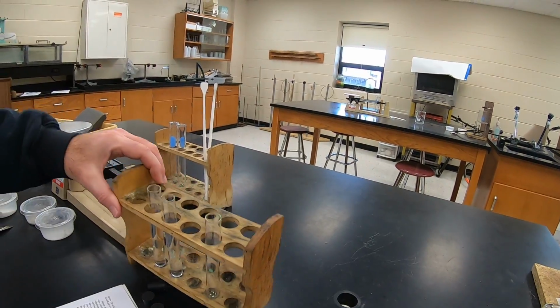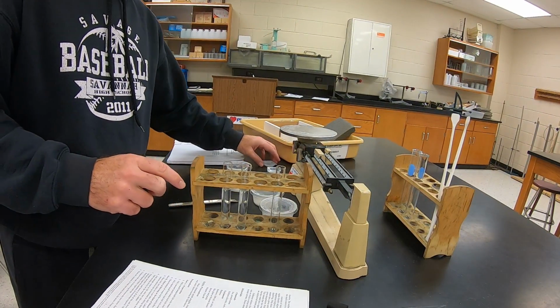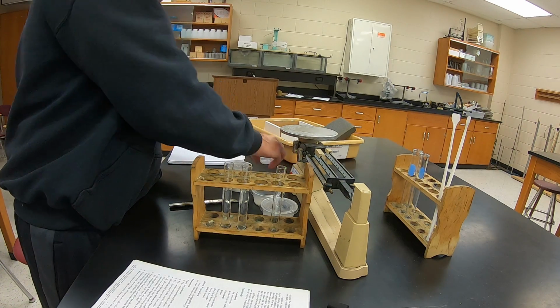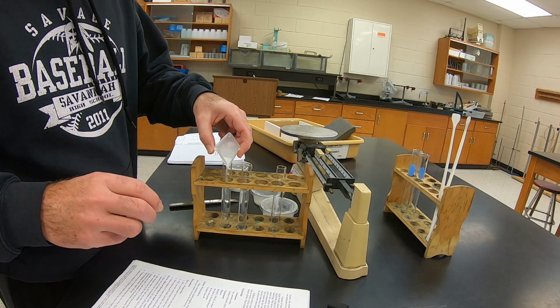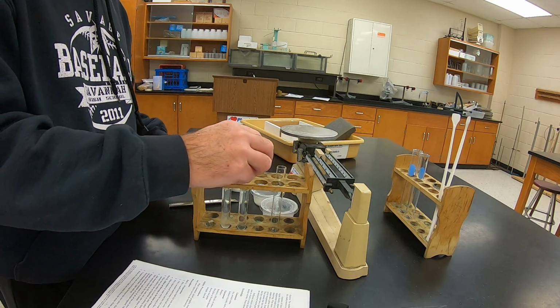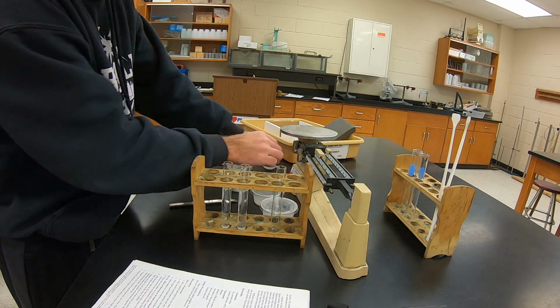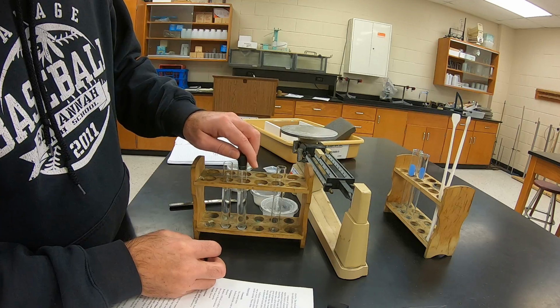So I've got my 2 tubes right here. This will be tube 1, the uninverted tube. And this one over here will be tube 2. So I'm going to pour my 0.2 grams of salt in. The salt's settling to the bottom. I'm going to stopper this one, and I'm going to invert it.